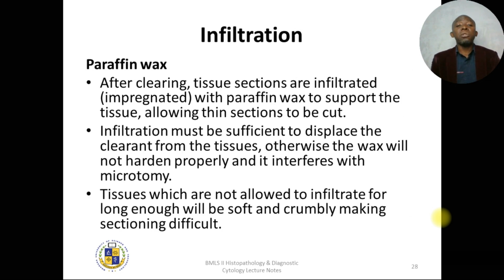So we move now to our next step of tissue processing, which is what we call infiltration. Let's talk about infiltration. Infiltration, just like the name goes, means permeating the tissue with molten paraffin wax. Paraffin wax is the agent of choice that we shall use in infiltration.